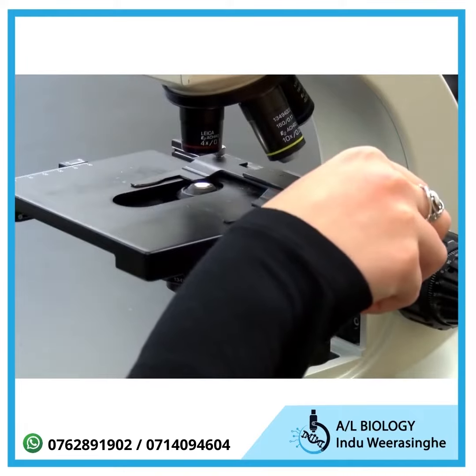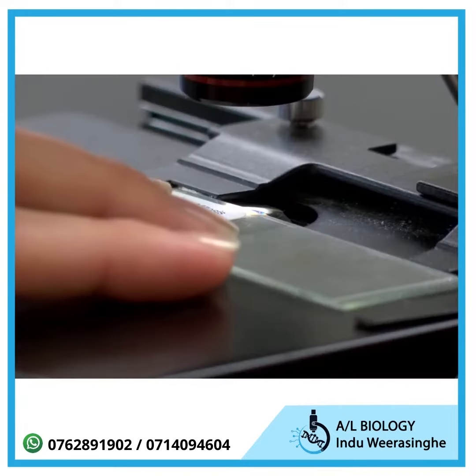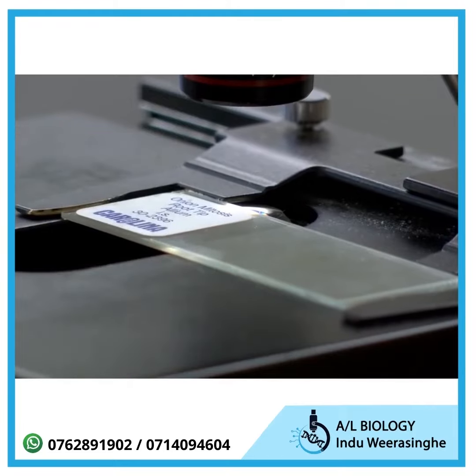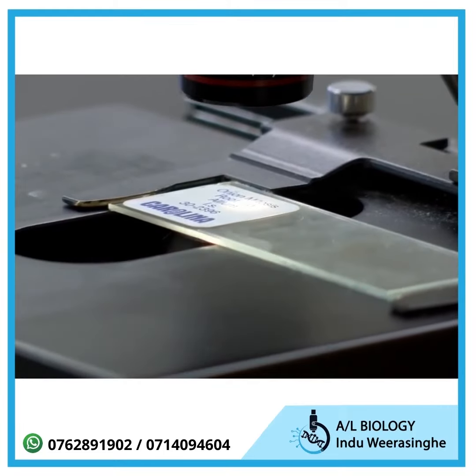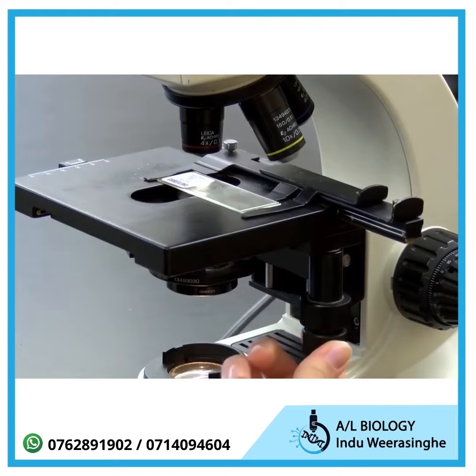Open the clip on the stage with one hand and slide a microscope slide to the back of the stage. Be sure the slide doesn't go under the clips that hold it in place. Use the knobs on the lower right side of the stage to center the specimen over the condenser lens.